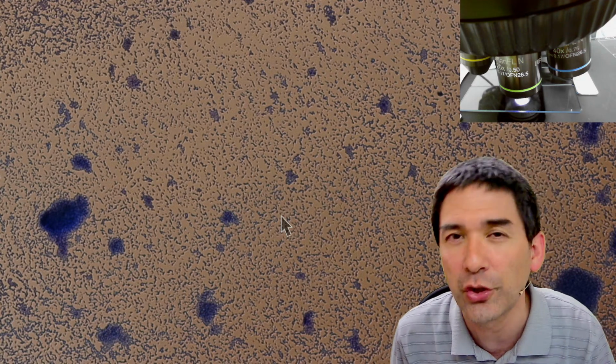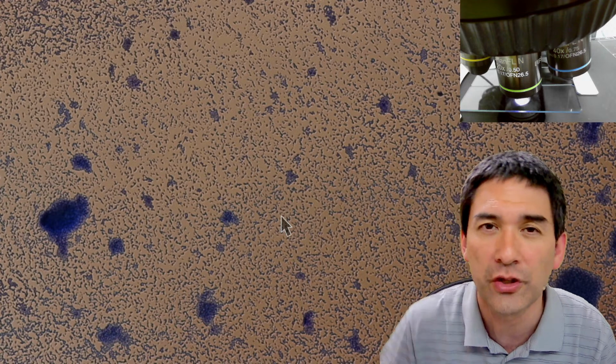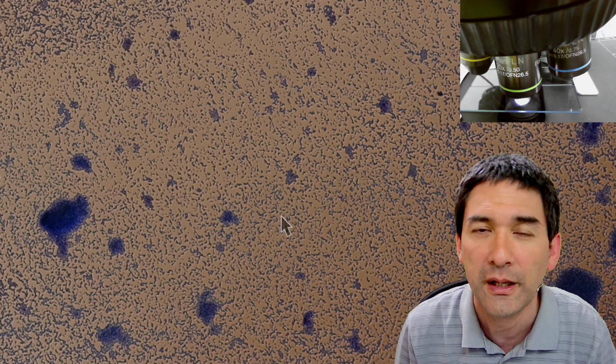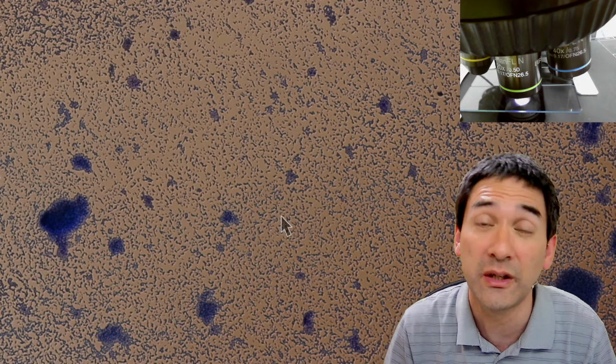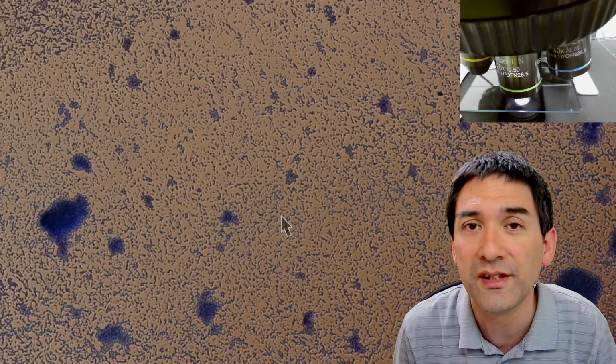Usually even the features are not so much different from each other, because the standard microscope has all of the same features: a condenser, coarse and fine focus, mechanical stage, and so on. But some microscopes you can connect, let's say, 5 objectives instead of 4, if you want to consider this as an additional feature.